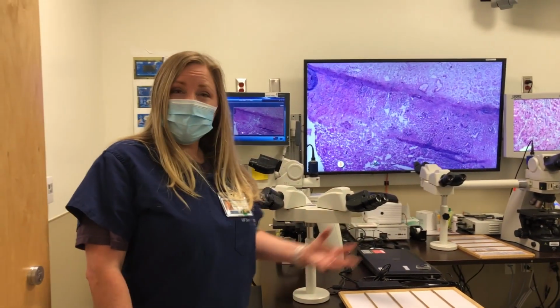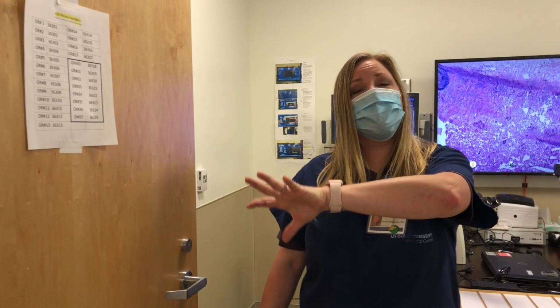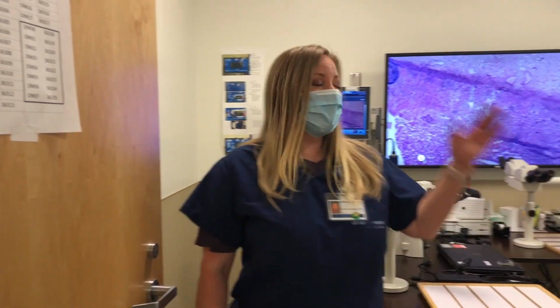So that's the basics of how tissue comes in, how it gets cut, how it gets processed, how we make slides for it, and how we get diagnoses out both in a rapid time and in normal time.